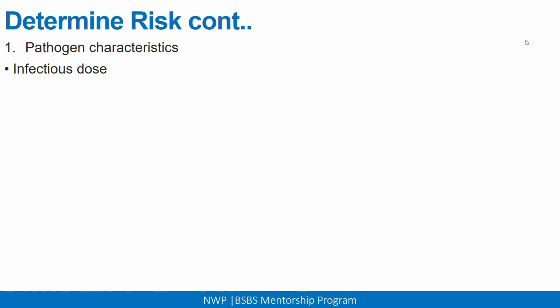Because if you only need like 2 organisms to get infected, it means that if you just get exposed to 2 organisms, then you get infected. So therefore the likelihood increases.